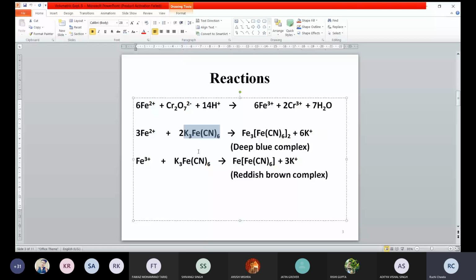Now, initially, when the reaction mixture is brought in contact with potassium ferricyanide, it will contain ferrous ions, since the reaction has not started. When ferrous ions come in contact with the indicator, the potassium ions will be displaced and ferrous ions will take their place. The complex that you see will remain intact, with no change in its formula. So if Fe2+ takes the place of potassium, ferroferricyanide will be formed. Why ferroferricyanide? Because in the outer sphere, ferrous ions are coming. That is why ferro.